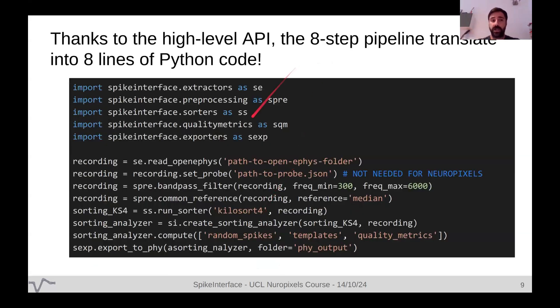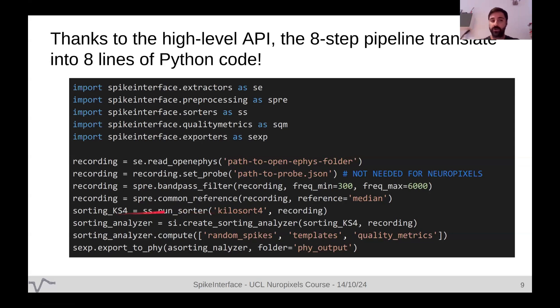It's a very high-level API. To read the OpenEphys folder you just call read_openephys. You can set the probe — not needed for Neuropixels since probe information is automatically extrapolated from the data. You can run a bandpass filter from the preprocessing module, common reference, and run Kilosort4 with a single line of code. Then you create the sorting analyzer object to compute many additional features including quality metrics, and finally export to Phy.